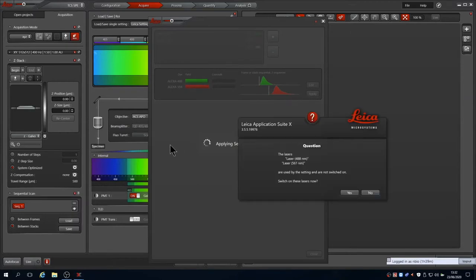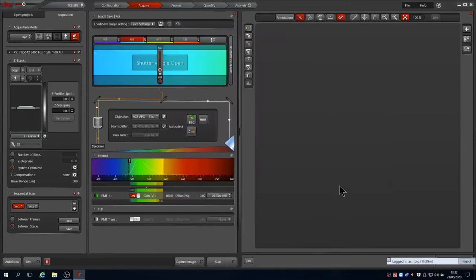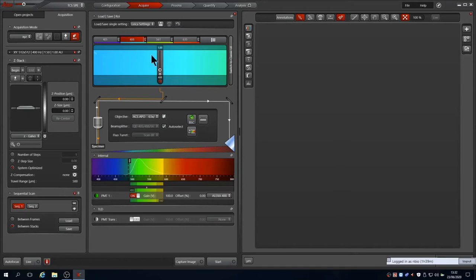Once you are happy with this, press apply to load the configuration. If the required lasers aren't already on, it will ask you if you wish to switch them on. Click yes to allow the software to do so.